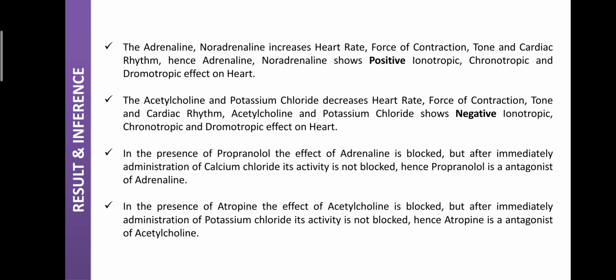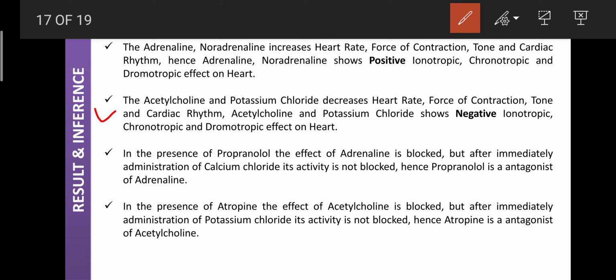That condition is treated with the help of adrenaline and noradrenaline. That's why adrenaline and noradrenaline are also known as cardiac stimulants. They are helpful for the treatment of congestive heart failure. Then the second conclusion: acetylcholine and potassium chloride decrease the heart rate, force of contraction, tone, and cardiac rhythm, and show negative inotropic, chronotropic, and dromotropic effects on the heart.